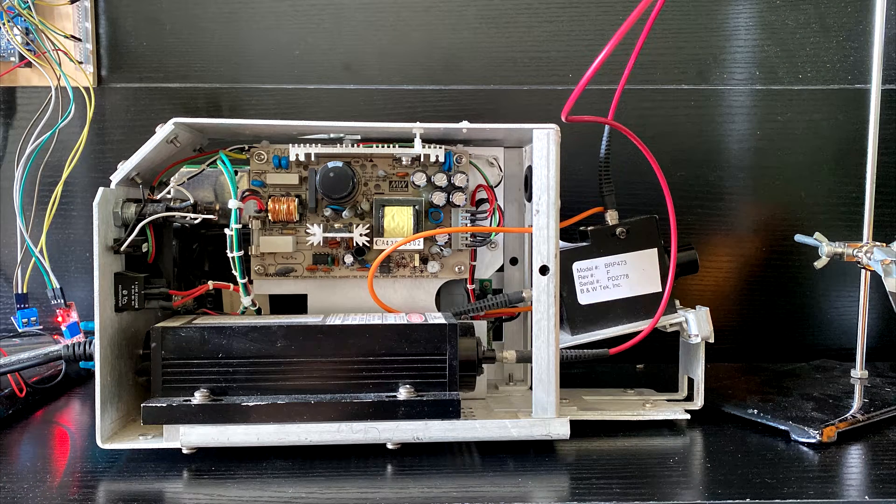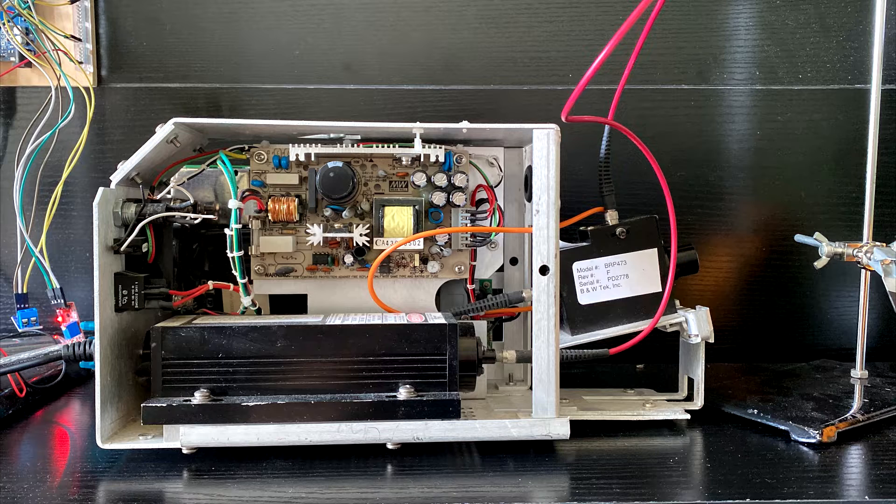If you have ever searched for an inexpensive UV diode laser, a spectrometer, or both, you may notice this item. It was popular on eBay a few years ago and I got mine back in early 2018.